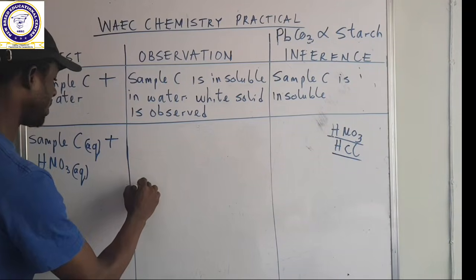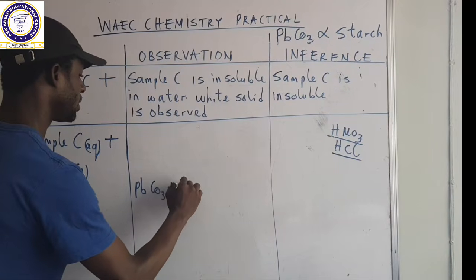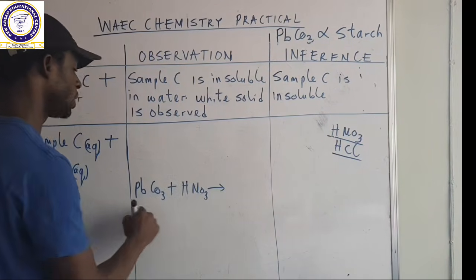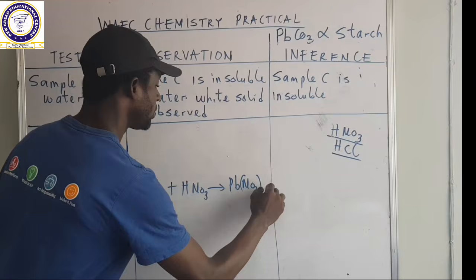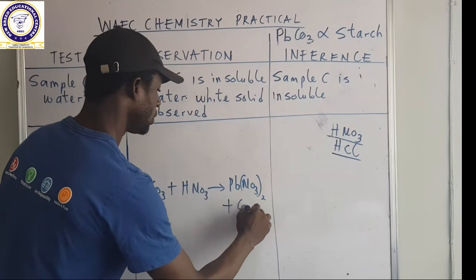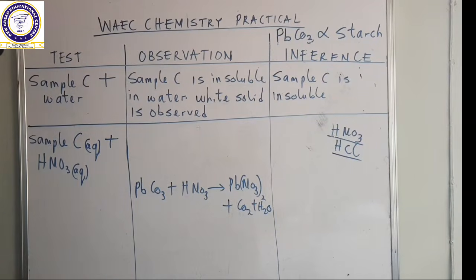The reaction is our lead carbonate plus HNO3. So we are going to have lead nitrate plus CO2 plus H2O.